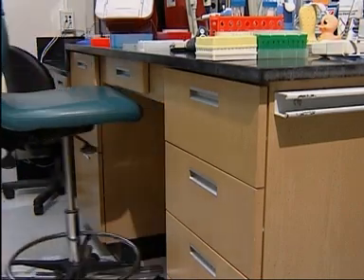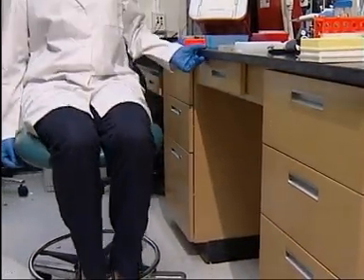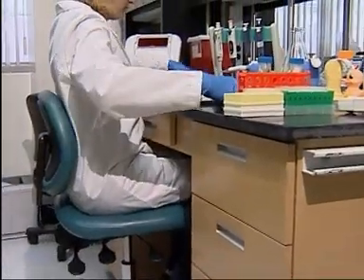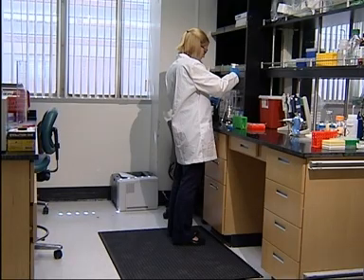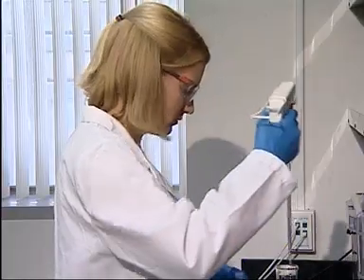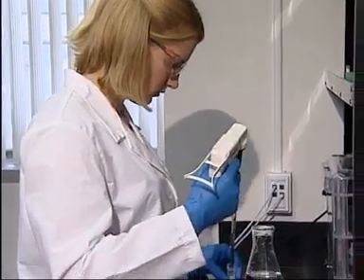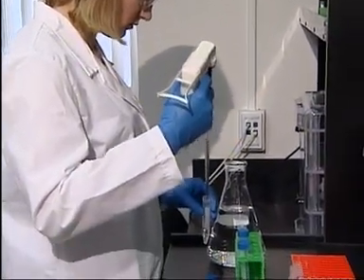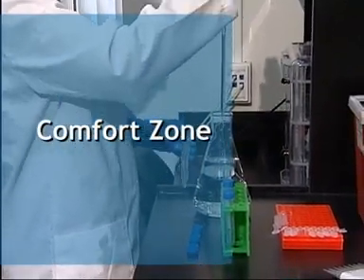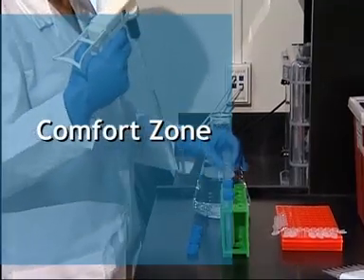Most laboratories have cutouts or open spaces under the work surface. Always try to work in one of these areas so you can stand or sit close to your bench. If you stand, consider the use of foot rails and floor mats to reduce fatigue. When sitting or standing by your workbench, make sure you can pipette at a comfortable height and reach. We call this the preferred or comfort zone. It extends between your waist and shoulders and includes the space between your body and hand when you make a sweeping motion with your elbows by your sides.